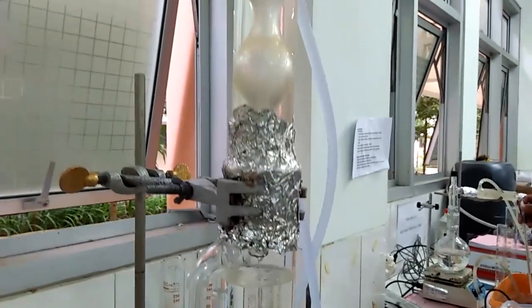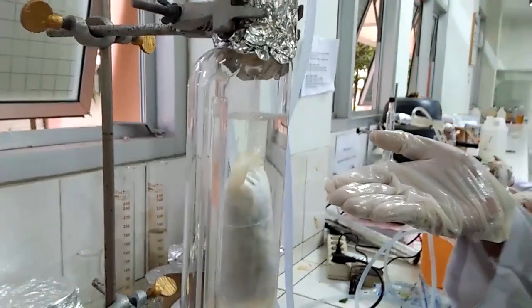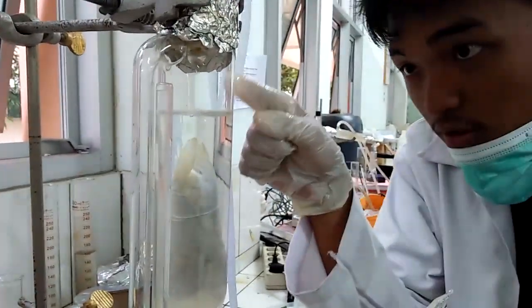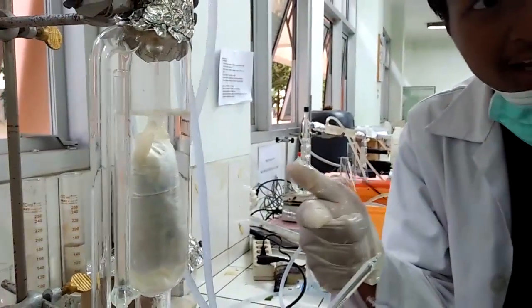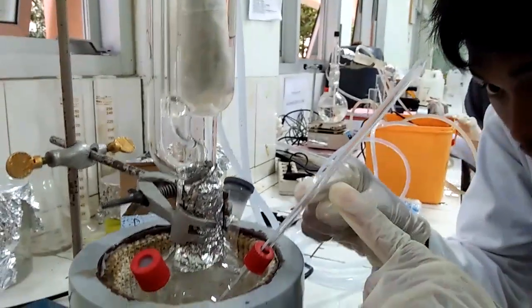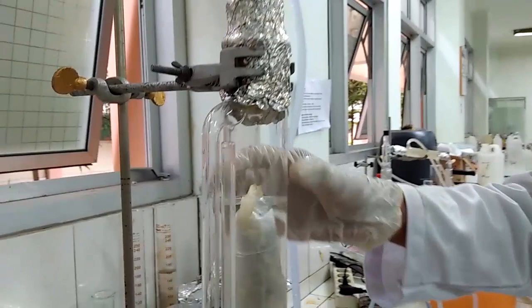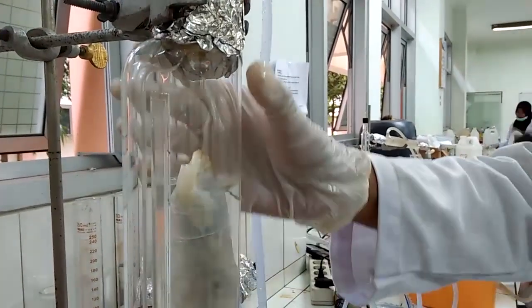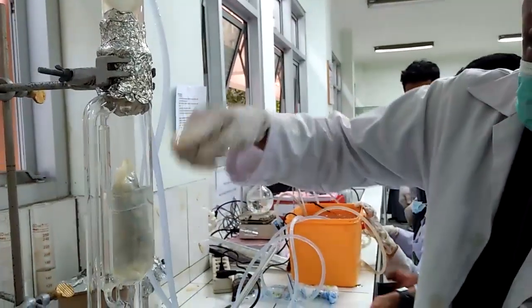Cairan di sini ialah hasil ekstraksi minyak atsiri. Pada percobaan kali ini kami melakukan 4 kali sirkulasi, dan tiap-tiap sirkulasi dihitung waktunya dengan menggunakan stopwatch. Ini ialah proses sirkulasi yang kedua untuk menghasilkan minyak atsiri.